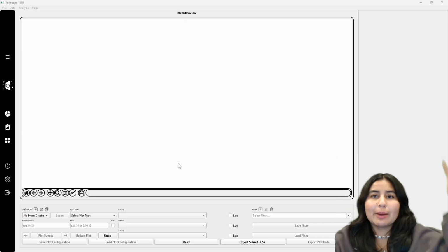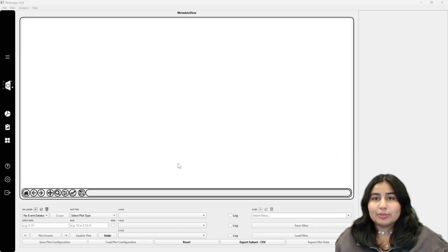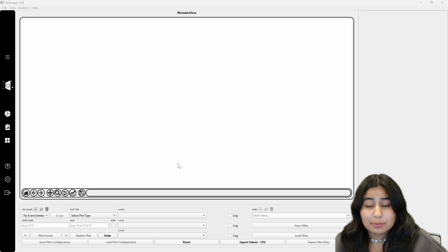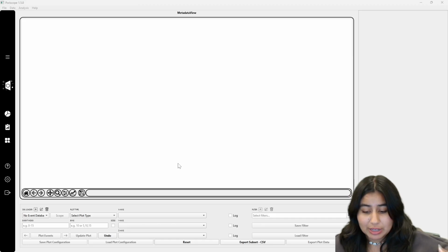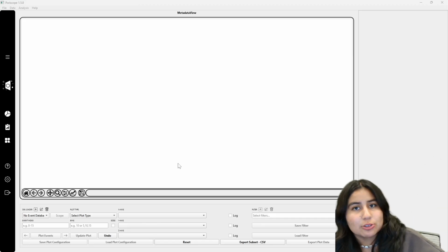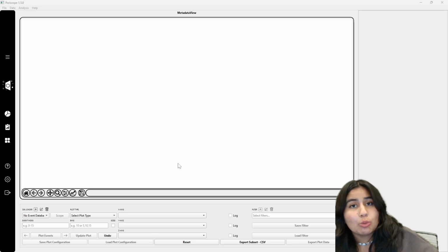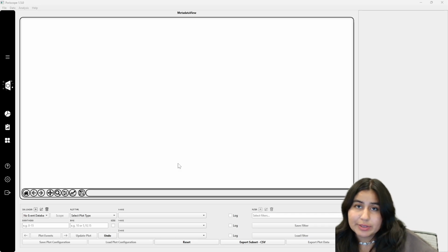So if we do a recap on the pipeline, we have loaded our raw data, our ionic current trace, we have cleaned it up, we have found events on it, we have saved these events, then we have loaded these events back into Poriscope, applied the algorithm that best suited our needs, feeded events successfully, and saved these events. So now we want to extract insights from these events.